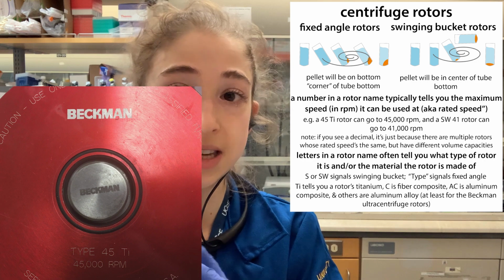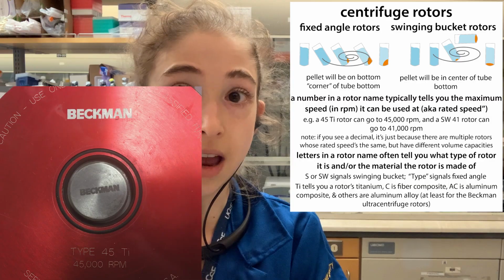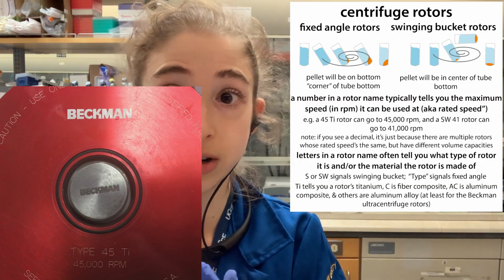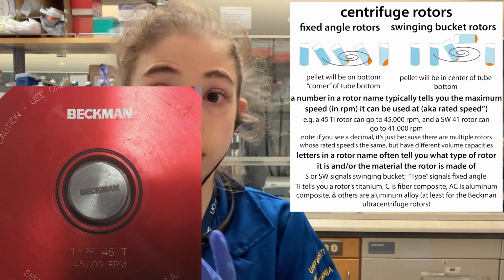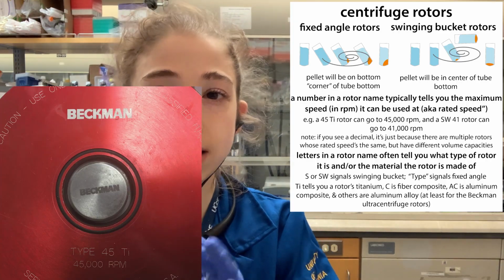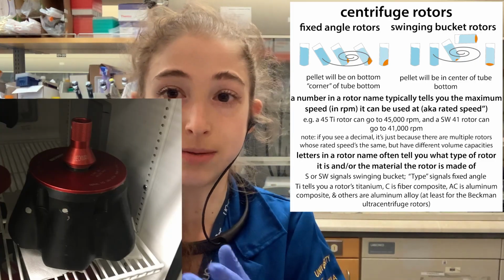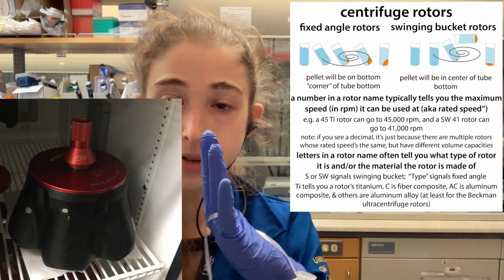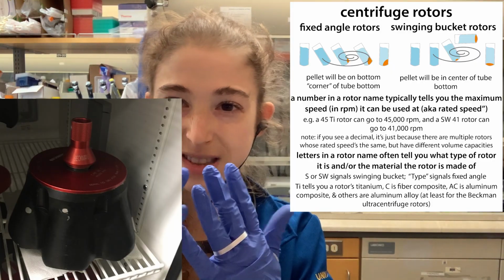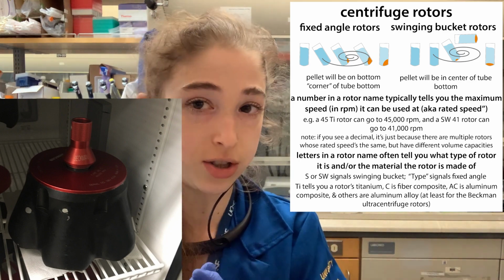If you see a C, that's a fiber composite. If you see an AC, that's going to be an aluminum fiber composite. And if it doesn't say, then it's likely an aluminum alloy, so some sort of aluminum mixed with other stuff. You might also see some different shapes of the centrifuges. When you have these metals, they're heavy. It's heavy to pick up the centrifuge. So sometimes to make it easier, they flute things, they bevel out in between the different buckets, so that it's easier to use.